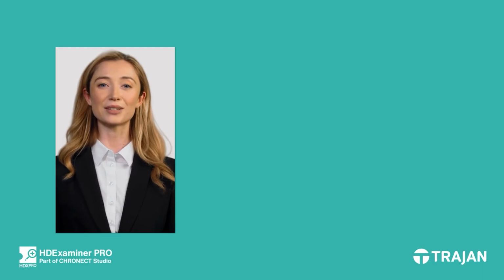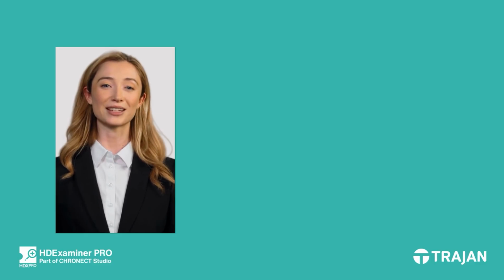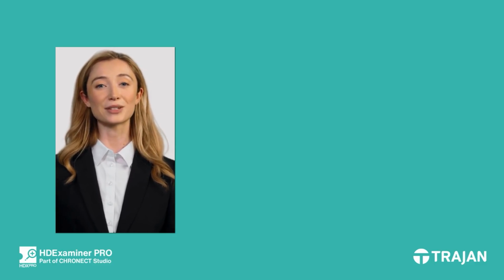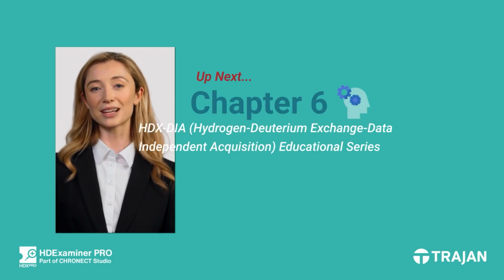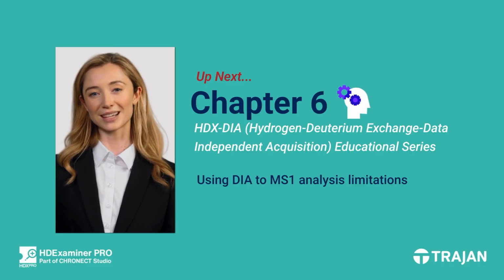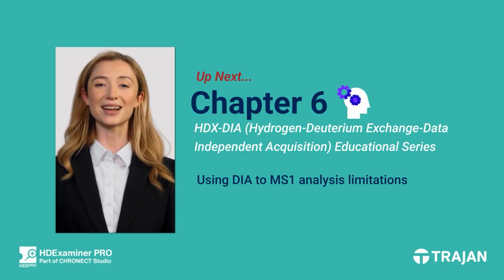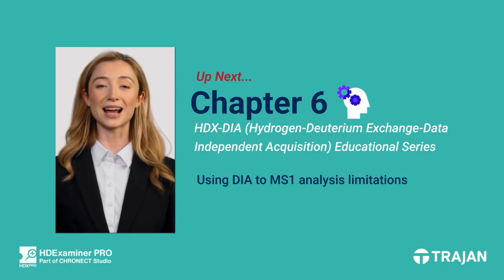In Chapter 5, we saw how DIA processing enhances peptide identification and deuteration validation by leveraging fragment-level data and robust statistical methods. Up next, in Chapter 6, we'll look at a specific case where MS1 analysis struggles, but DIA overcomes those limitations. You'll see how fragment ions in MS2 space can salvage measurements, even when peptides are heavily overlapped in MS1.